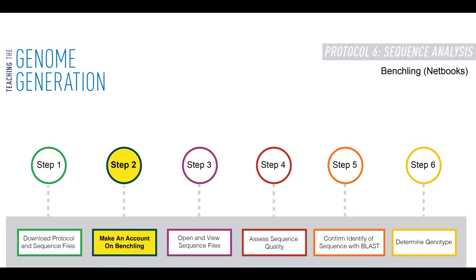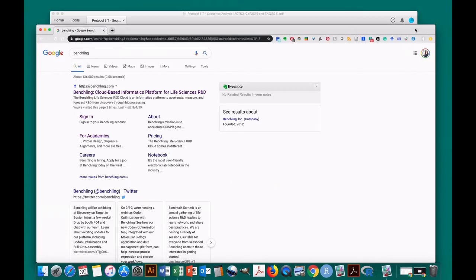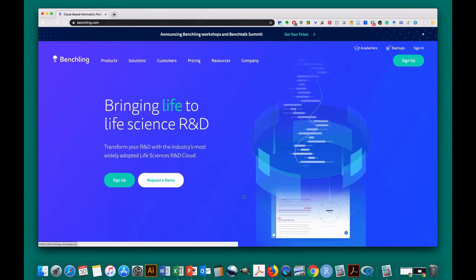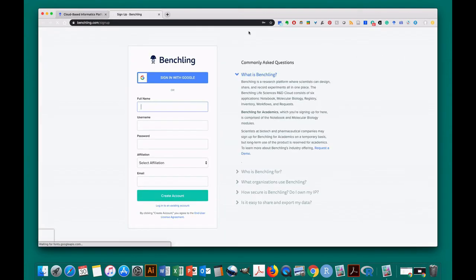In this video, we'll be going through step two of six. Navigate to the website and on the right side you'll find where to click, and just follow the prompts to make an account.